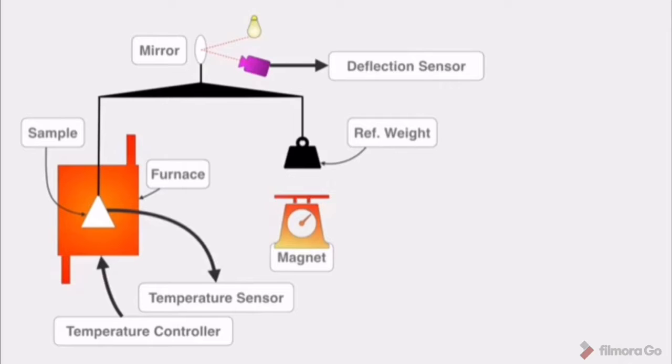A shutter fixed to the beam changes the amount of light reaching the phototube or electromagnetic reading, which causes a restoring force to be generated by passing a current through the electromagnet that serves as the pivot for the balance beam. A permanent magnet above and below the pivot provides the magnetic attraction to the electromagnet. The force required to restore the beam is proportional to the current, which is recorded.